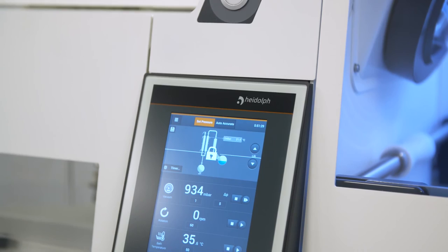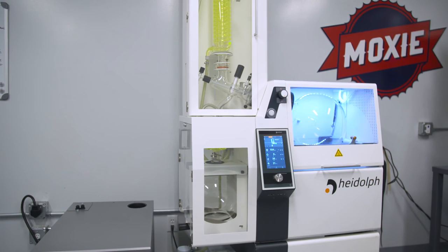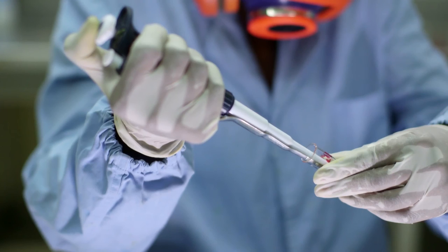By using Heidolf HIVAP systems, the company hopes to create a safe environment for extractors while also providing a scalable platform. Heidolf products have been traditionally used in laboratories that make pharmaceutical medicines, and people making cannabis medicines should be afforded the ability to use the same equipment to make high-quality cannabis medicines as well.